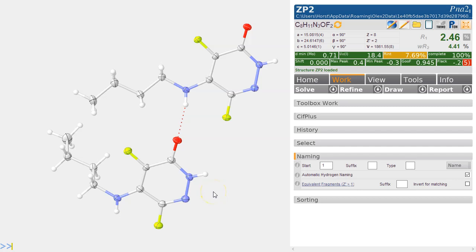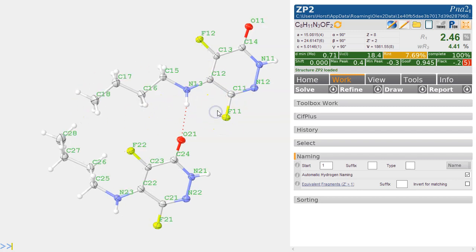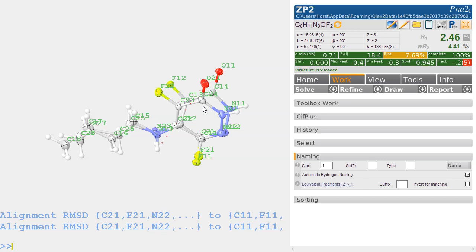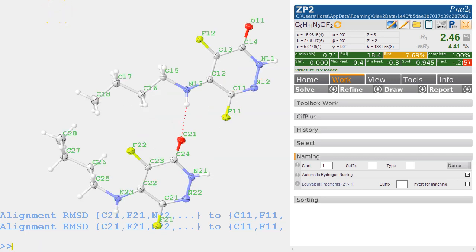Consistent naming structures are important, and somebody wants a naming scheme on these things so they should match. F3 allows you to show the labels as they are at the moment, and we want to make sure that these actually match, and they do. They will only match if there's no Q peak showing on the screen and if all the hydrogens match.